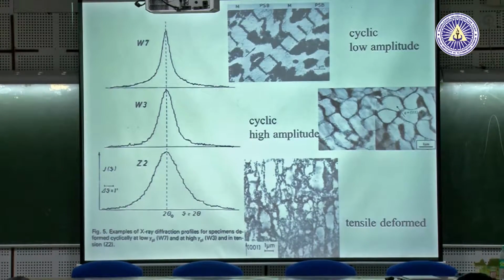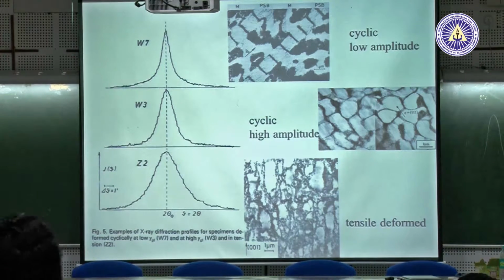These are the corresponding TEM micrographs. The upper one corresponds to a cyclically deformed single crystal with persistent slip bands.